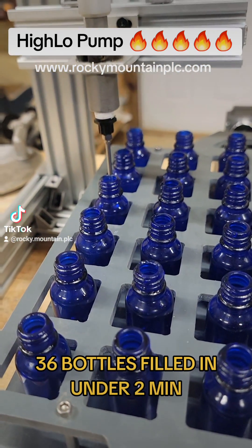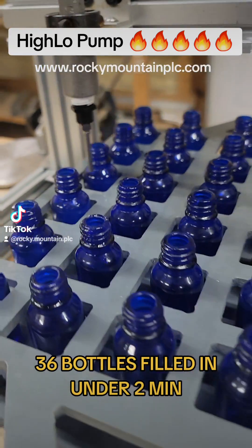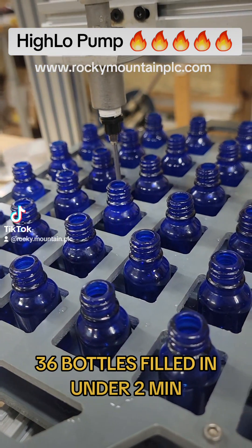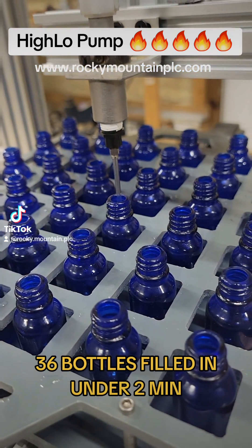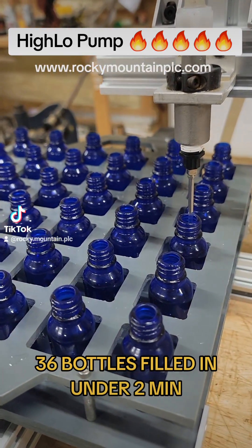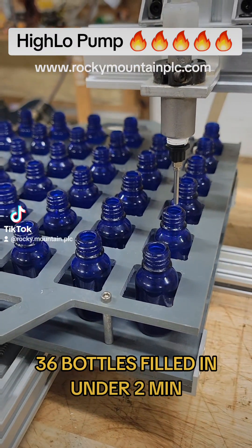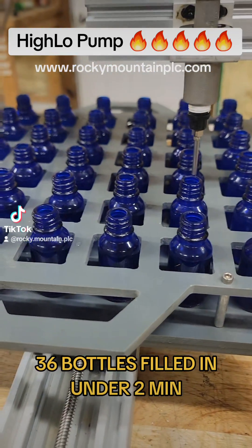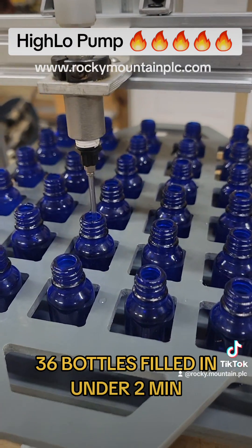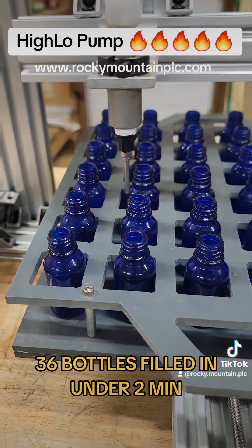This pump is lab rated for 8 gallons a minute, so it does have a lot of pushing power. However, it is highly accurate. It is a little different than peristaltic filling like our normal bottle fillers. It does have wetted parts; however, those wetted parts consist of stainless steel, neoprene, and viton, depending on your process and what you need for your SOPs. We've been able to get it working on conveyor belts, as a matrix filler, and there is a standalone version as well.